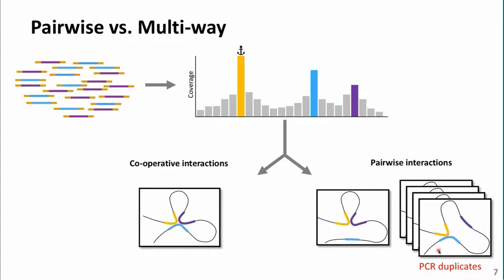We also need to consider that PCR duplicates are going to change the frequency of observed fragments. Interactions between yellow and blue might be amplified multiple times, while interactions between purple and yellow are not amplified as much. This changes the ratio of observed interactions, and that is problematic.